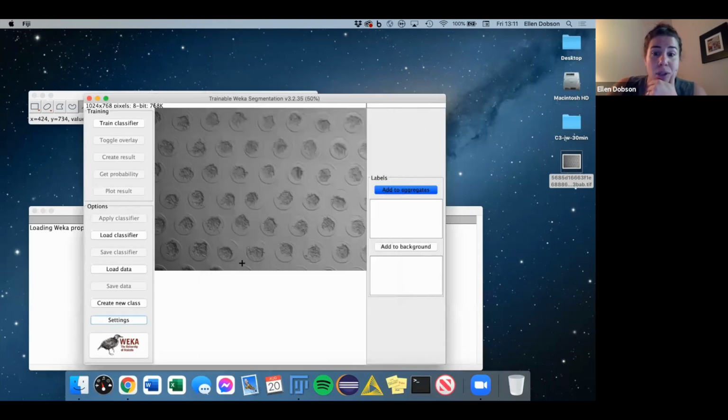Okay. So now we're going to just draw. Now what you do like is, oh, sorry, go ahead. Is someone asking a question? No. Okay.